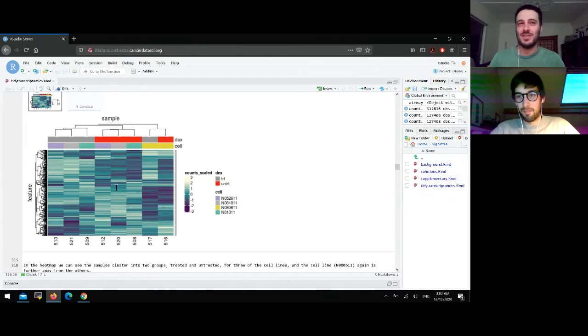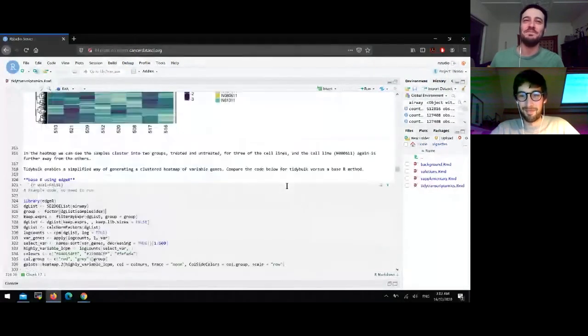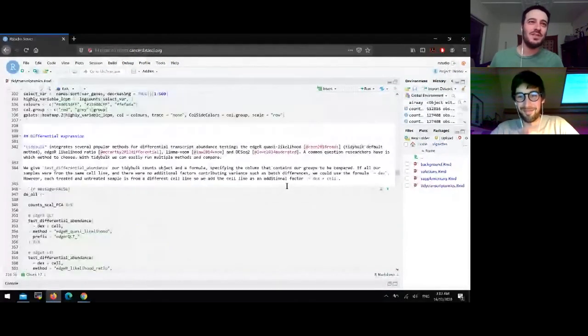But it is a nice suggestion. I developed this package, so I will think about adding colorblind palettes as well. Thanks for the question.